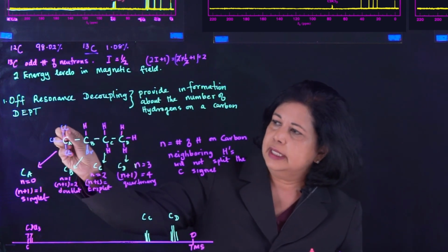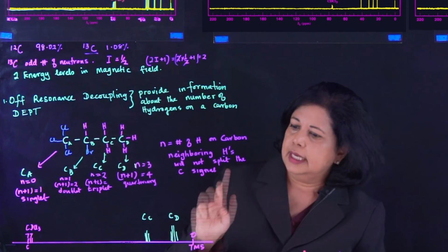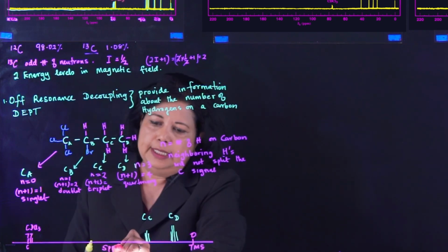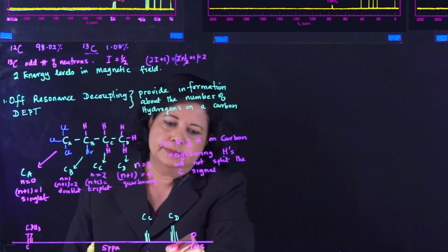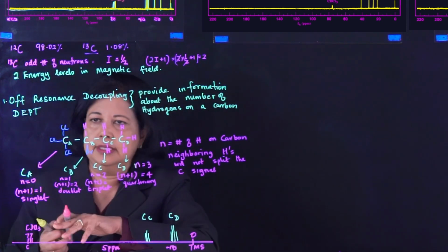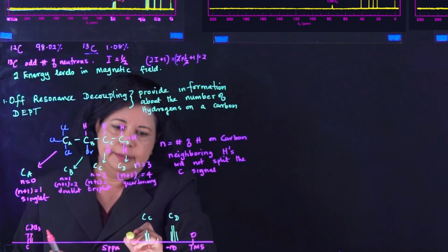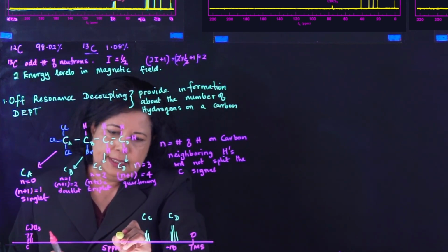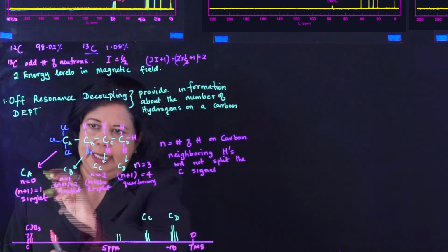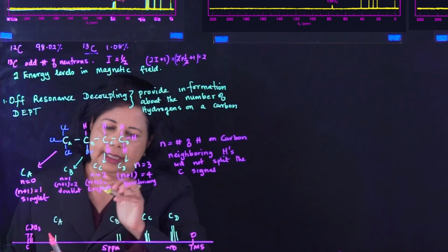So by the time that inductive effect gets to it, it hardly even feels it. That's probably close to about 10 ppm on the delta scale. And this Ca would be close to about 77. The next one here would be a doublet, and then this one would be your Ca. This is just not drawn to scale.